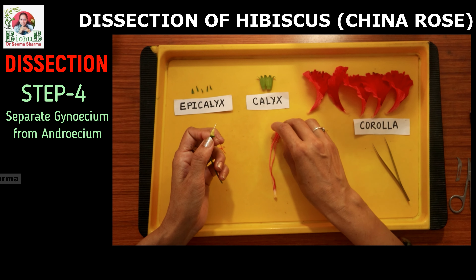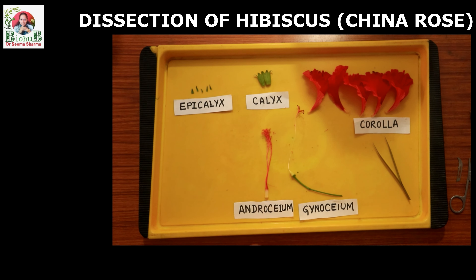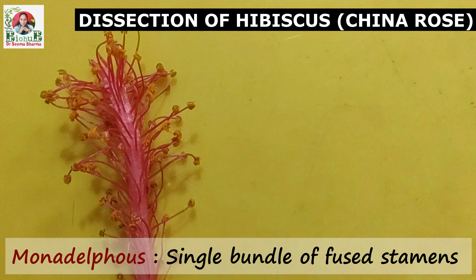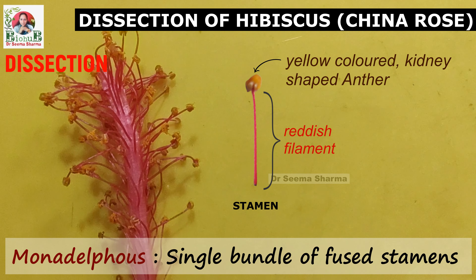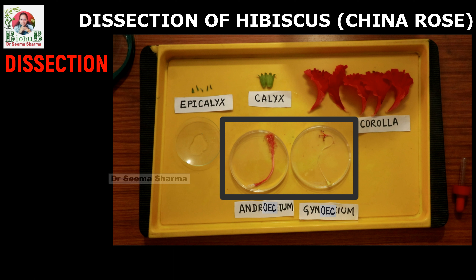So finally we have separated the male and female parts of hibiscus. Now pay attention to the androecium — the staminal tube. Viewing its upper part more closely: the androecium of hibiscus is monadelphous, meaning it is made up of only one group of stamens. Each stamen has a short red colored free filament bearing a yellow colored reniform or kidney-shaped anther on the top of it.